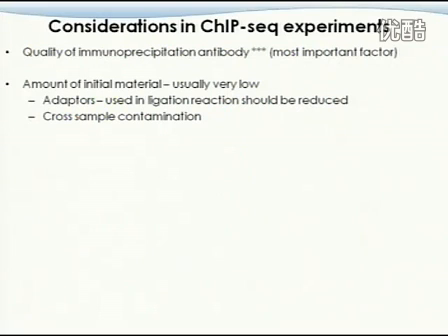But the point here is, regardless of what you work on, I know some of the students working on the hematopoietic stem cells, and it's really, really hard to get a lot of initial material out of those. I think one of the papers published using ChIP-seq to study something in HSC, human hematopoietic stem cells, used 10^7 cells, all right, 10 million HSC.